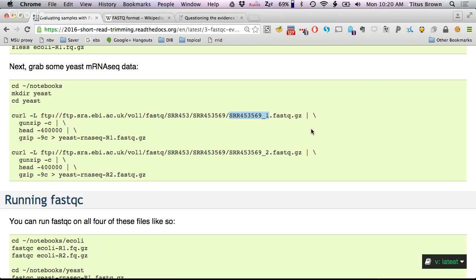So the question is curl. What is curl? There are two basic commands that can be used for retrieving remote data. One is wget and one is curl. wget says get from the web, and curl is C URL, and it's just a joke. So I use curl. Other people use wget. They have different syntax, but they do the same thing. They're both a way of doing what your browser would do if you clicked on a link, but instead of doing it on your laptop, it's doing it on whatever machine you're running the curl or wget command on.